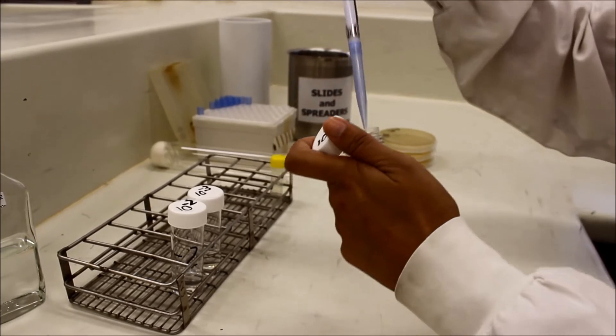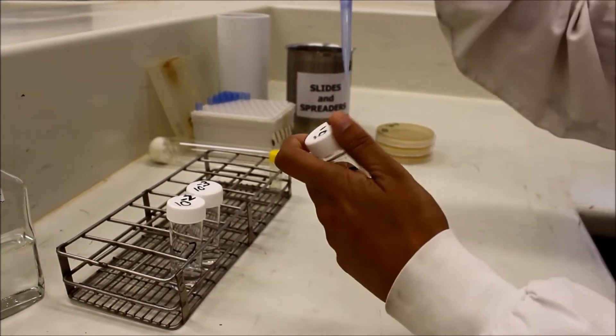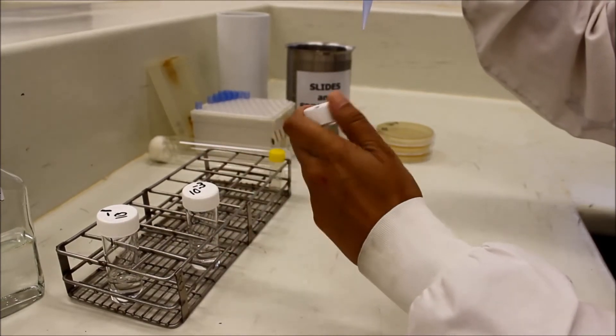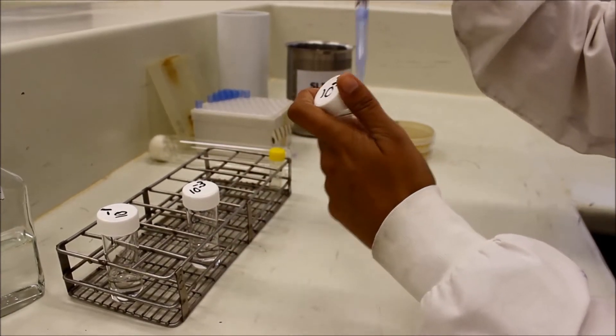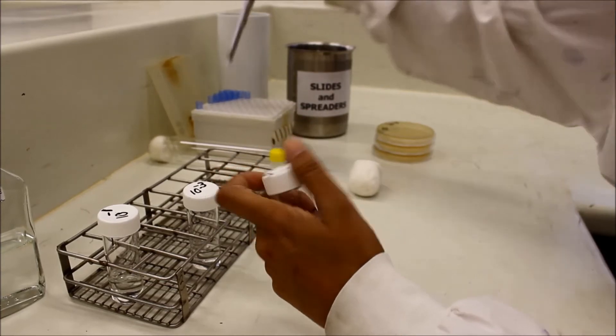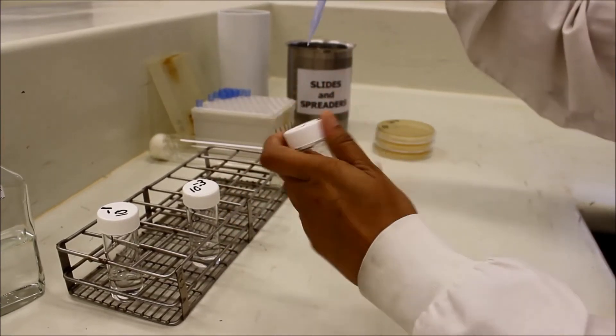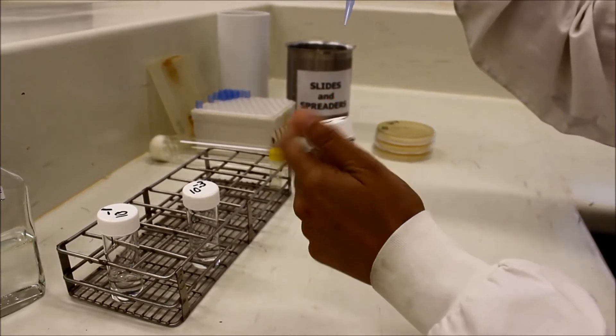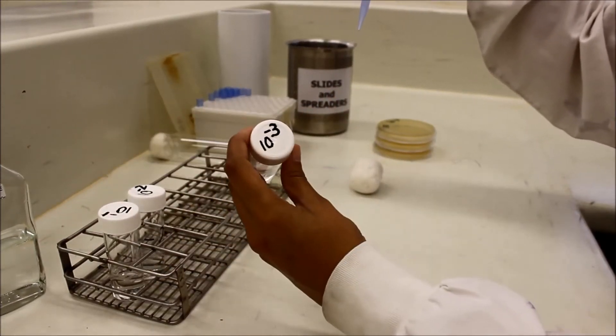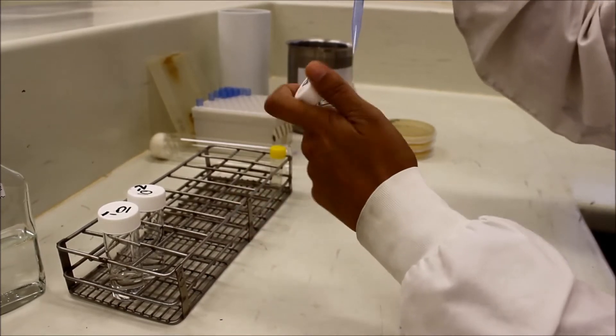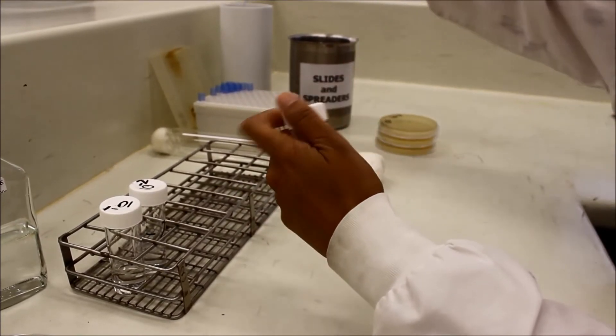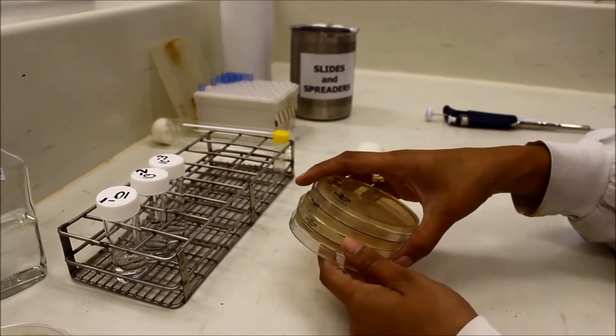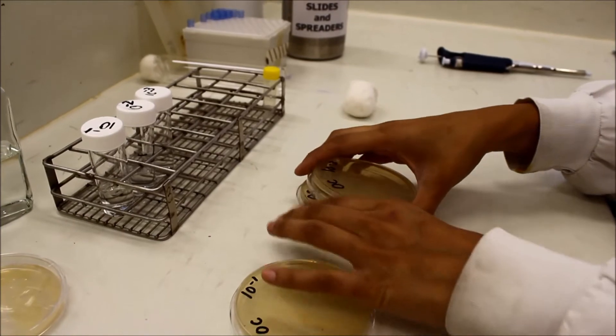You will then prepare the remaining 10-fold dilution. These dilutions are what you will use for your viable count. Make sure you clearly label all your plates beforehand.